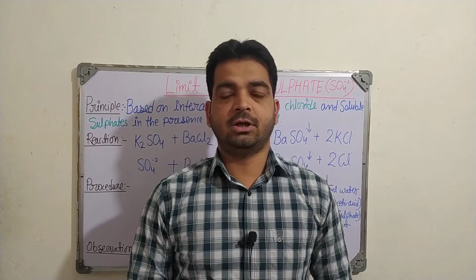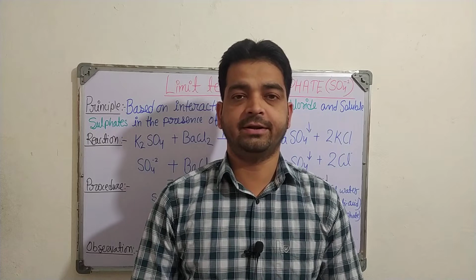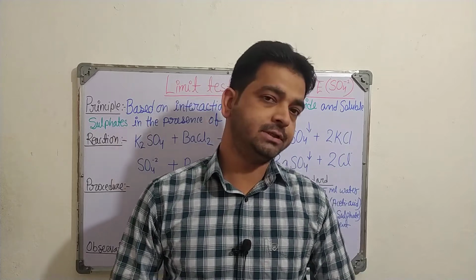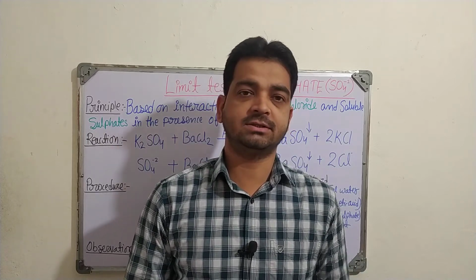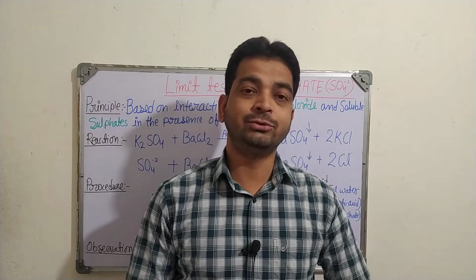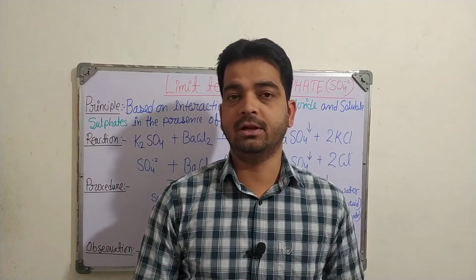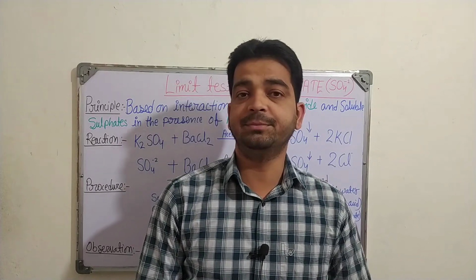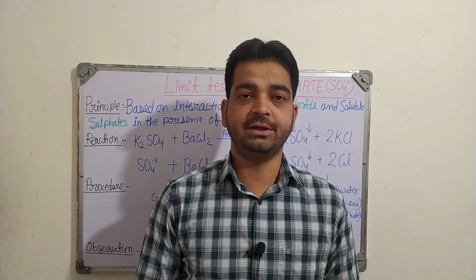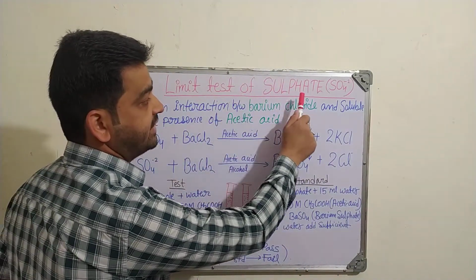Hello students, now we are going to discuss the limit test of sulfate. There are many impurities, as we have discussed in the previous classes, which might be there in your pharmaceutical products. We need to test whether it is within the limit or outside of the limit, whether it is passing or failing the limit test. So today we are going to discuss the limit test of sulfate.